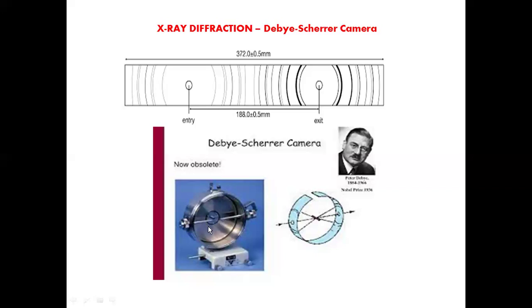The X-rays are used for the study of crystalline solids because the wavelength of the X-rays is comparable to the dimensions of the unit cell. Crystalline solids have atomic planes, and two successive atomic planes act as a slit whose width is comparable to the wavelength of the X-rays, and that is why X-rays are the only possibility to study crystalline solids.